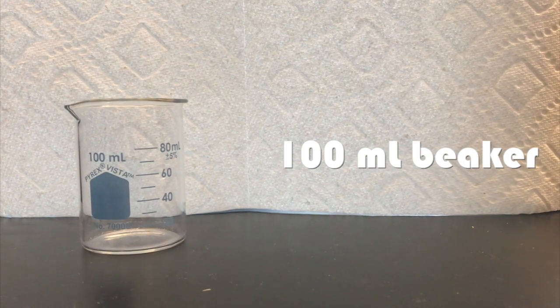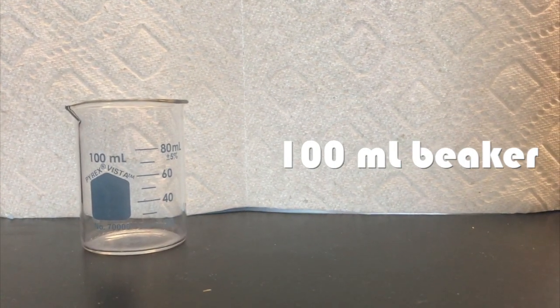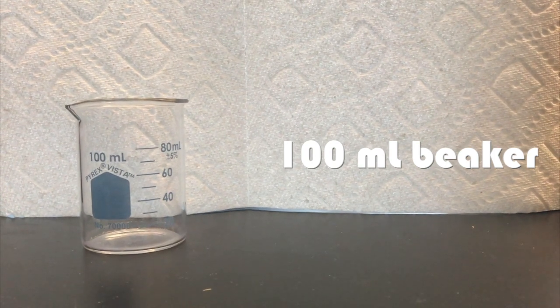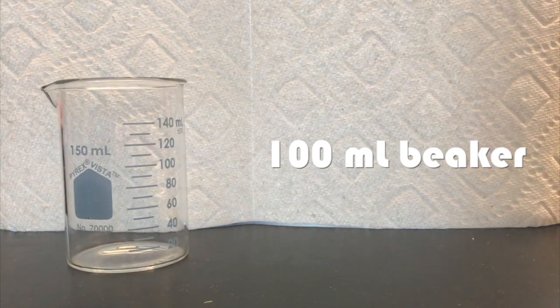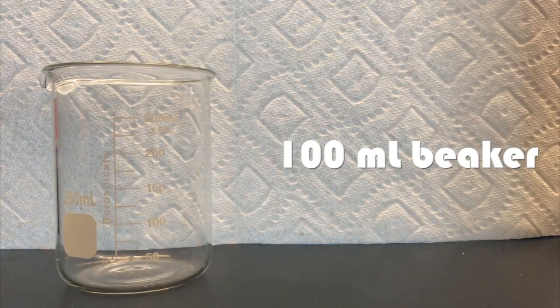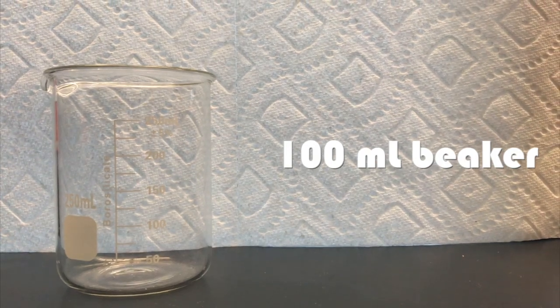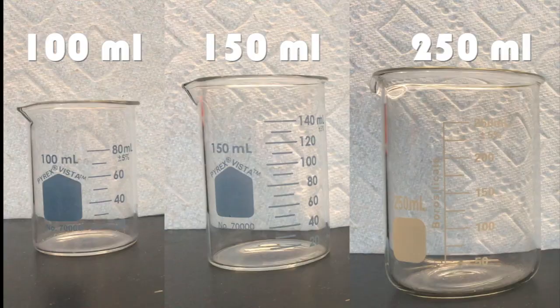This is the 100 milliliter beaker, though there are many other sizes of beakers. For example, there is the 150 milliliter beaker and the 250 milliliter beaker. Nevertheless, these beakers are all used to hold and pour liquids. Additionally, it can also be used for mixing, stirring, and heating chemicals.